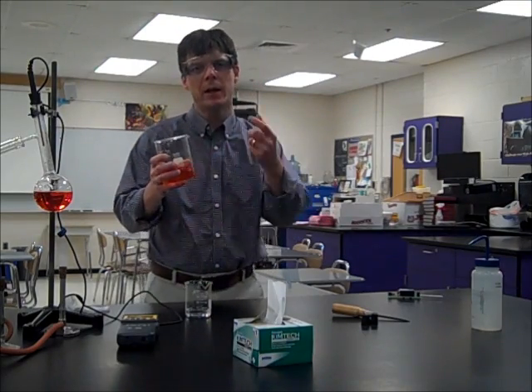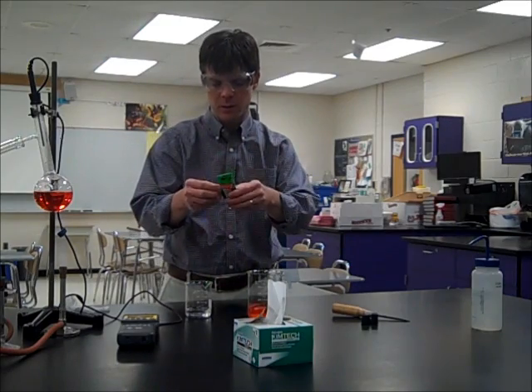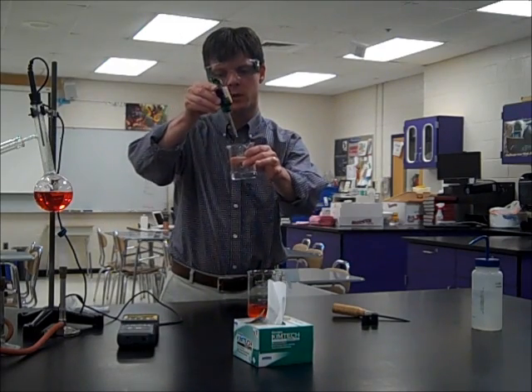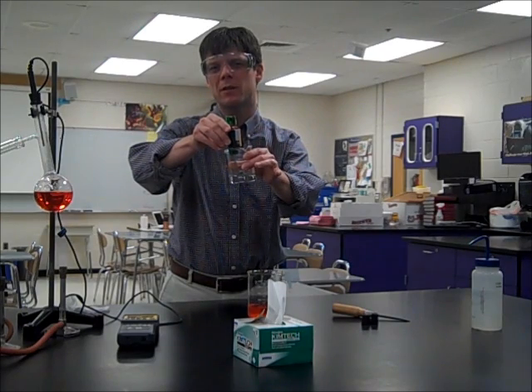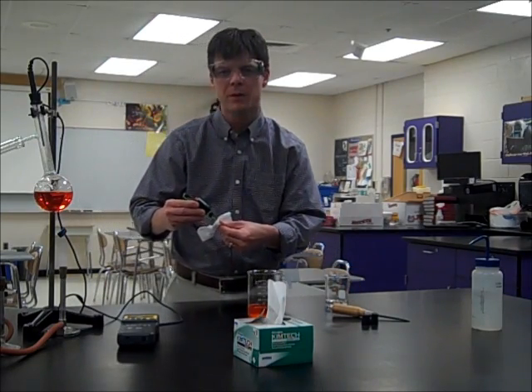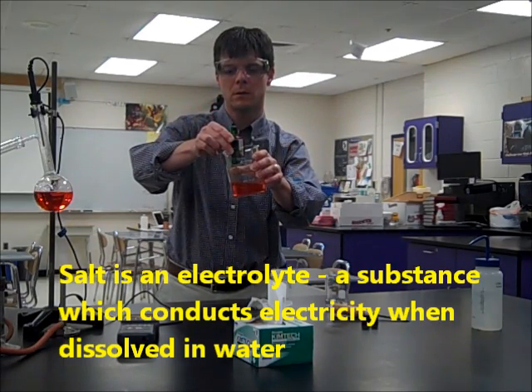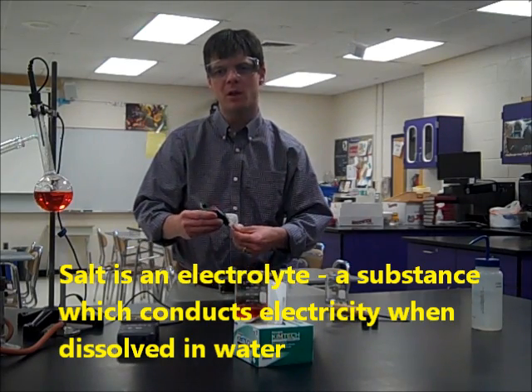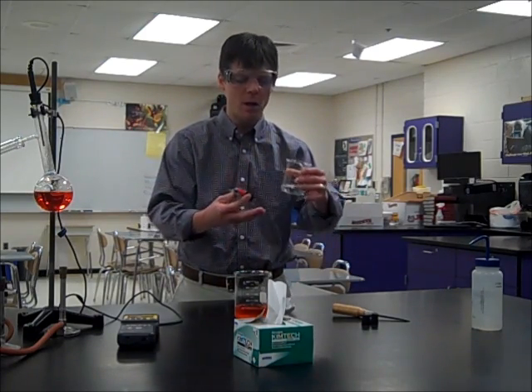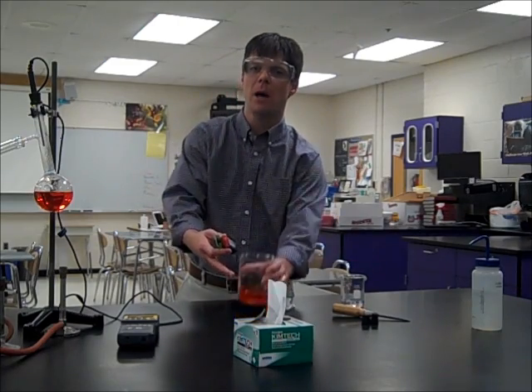Remember the solution that we're distilling is a solution of salt water with red food coloring added to it. I've brought in a conductivity tester. I'm going to go ahead and turn that on and test first some distilled water. You can hear a small amount of beeping telling us that there's a small amount of conductivity from the distilled water. Let's compare this to what we see if we're testing salt water. We hear a much louder tone — this is telling us that the salt water is very, very good at conducting electricity. Distilled water, purified water, should not conduct electricity at all. This tells me that my sample of water here does have some dissolved particles in it, but not nearly as many as my salt water solution.